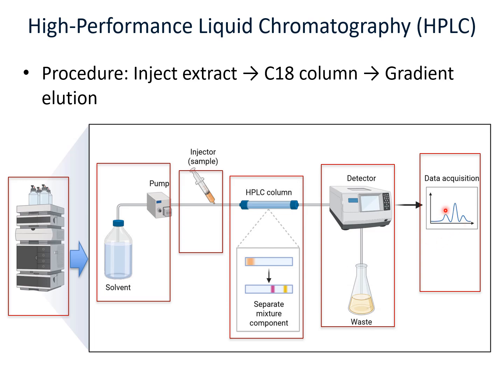So each particular peak represents a compound that has been separated in the column.